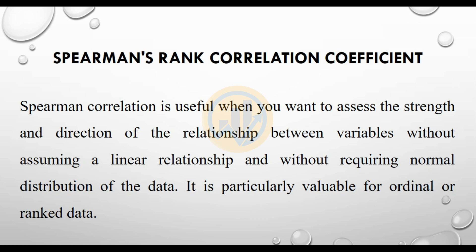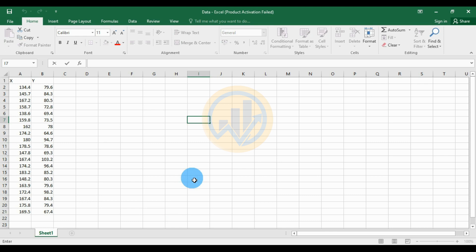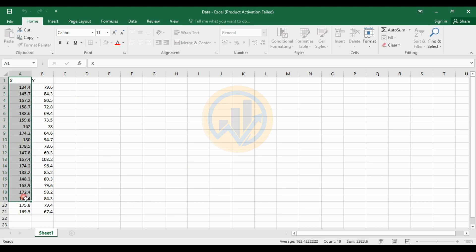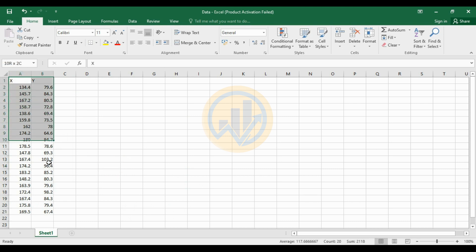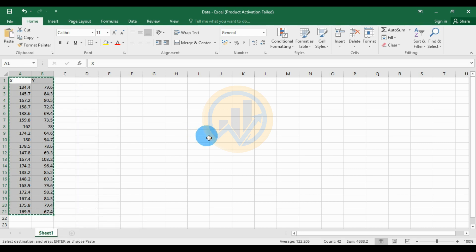Now let's go to the dataset for the Spearman rank correlation coefficients. The dataset has already been entered in an Excel sheet — the first variable is X and the next variable is Y. We will copy and paste this data into GraphPad Prism software.